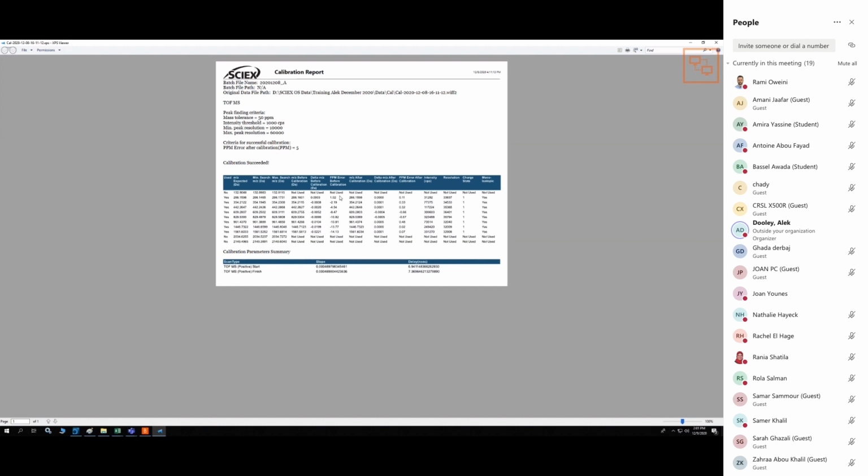And I don't know if the heaters, so there are little heaters in the time of flight, and the purpose of the heater is to keep the metal of the time of flight chamber the same temperature. And as you might know, if metal is cooling or heating, it will change its dimension.